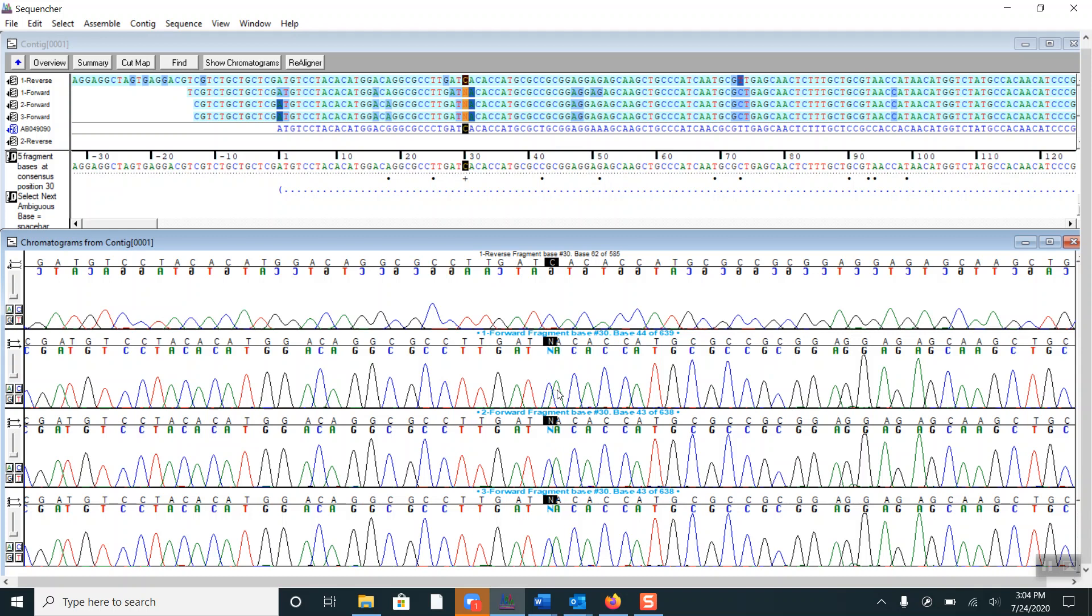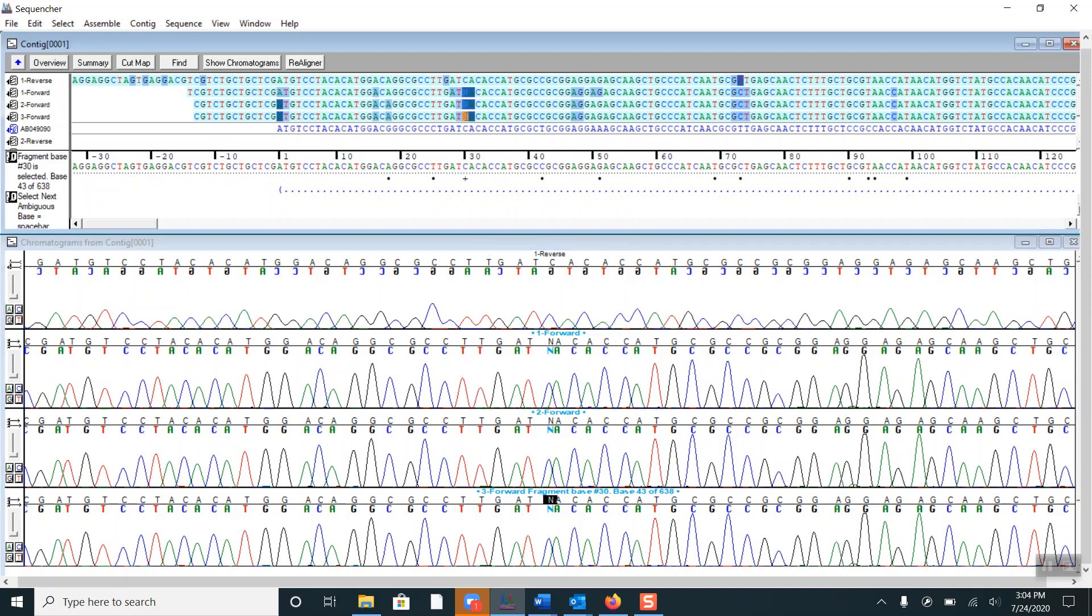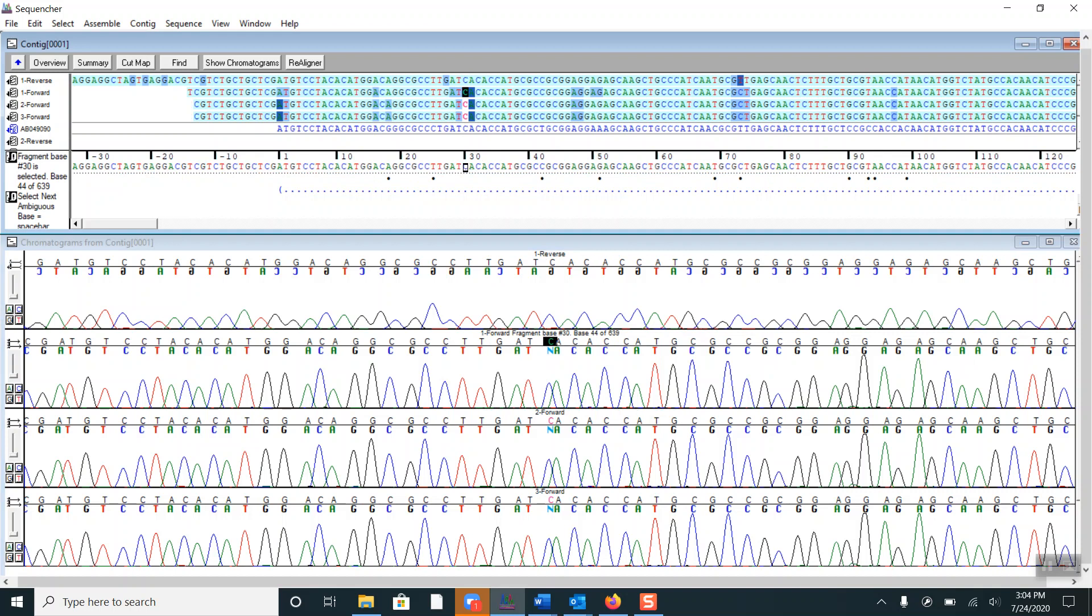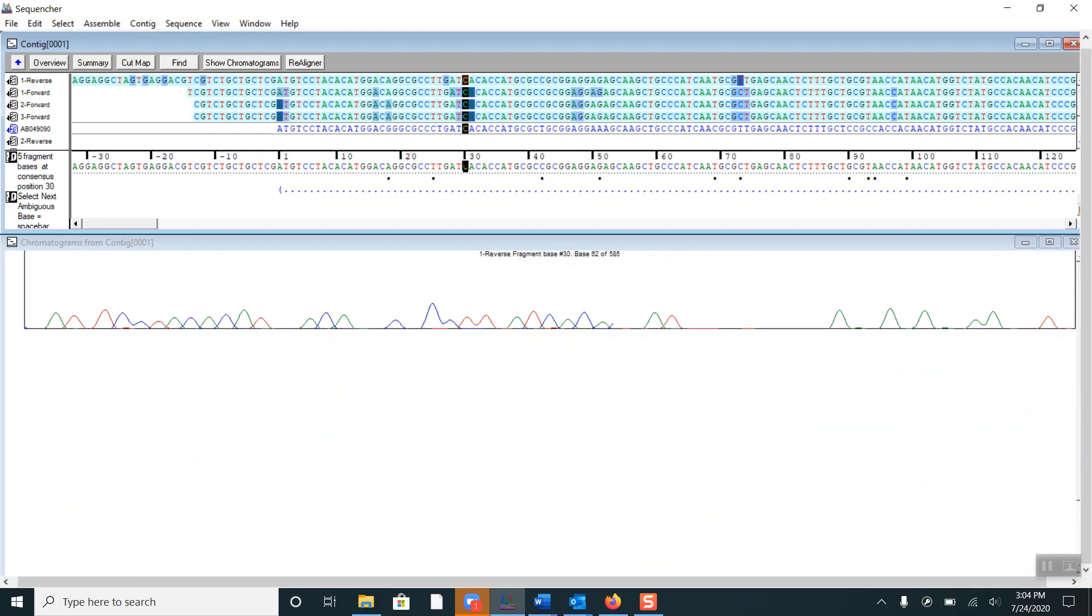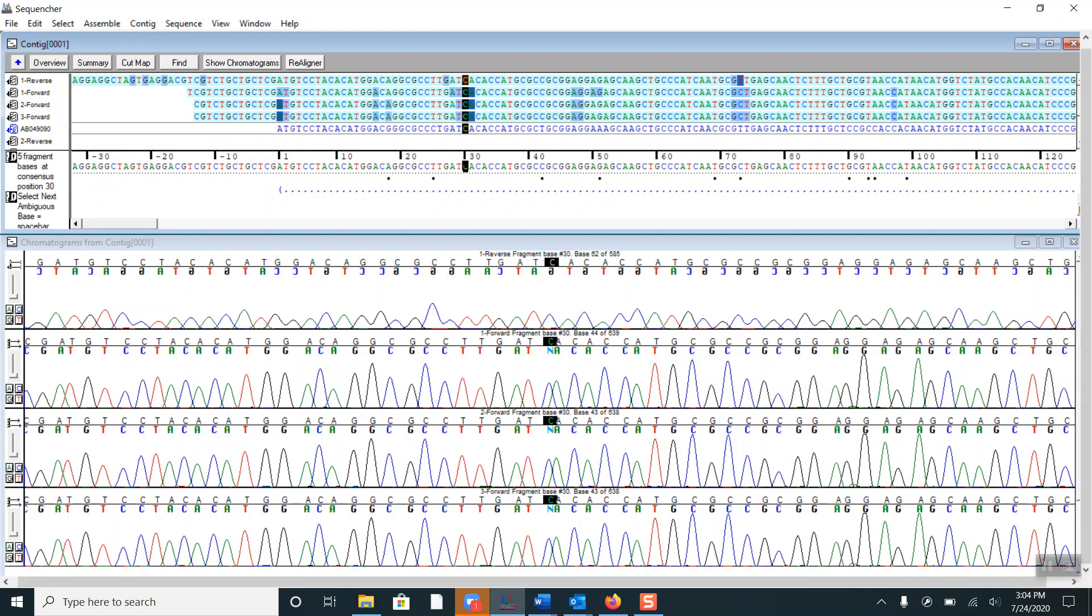So I will go ahead and change each of them to C manually. To do that, I simply click on the base and type C. I want to make sure to click on the consensus sequence again, and you can continue going through the base disagreements and ambiguities.